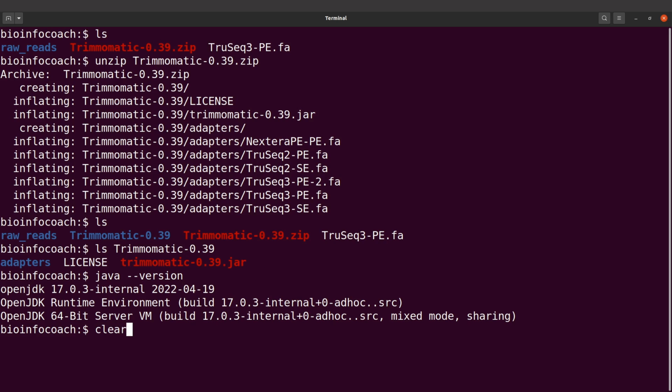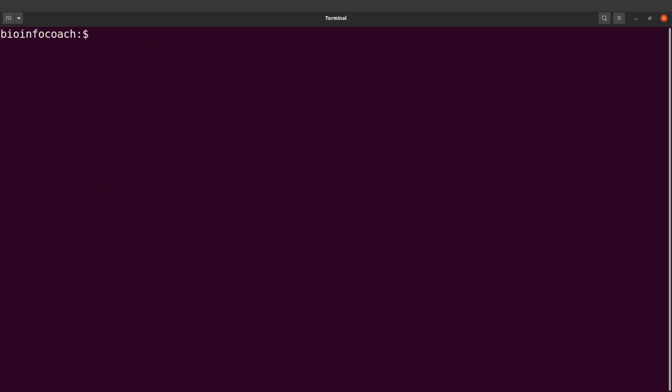Okay, so now we are ready to start the exercise. So let's continue. All right, so we can start. Let's do an ls to check our files again. Everything is ready. All right, so we can continue.